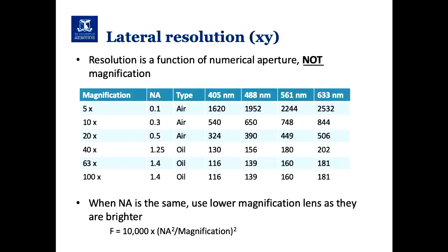I've put a table here which shows confocal lateral resolution, so you can choose your favorite objective. Again, we're looking at the NA here. If we go to, say, the 1.4, which will tend to be the highest NA we'll have on most of our systems, and we're looking in the GFP wavelengths, it's saying that our resolution is about 140 nanometers. This is a theoretical value, so it assumes a perfect system. I can assure you that there are no perfect systems. When we measure lateral resolution, it will come out more in the range of 200 to 250 nanometers.